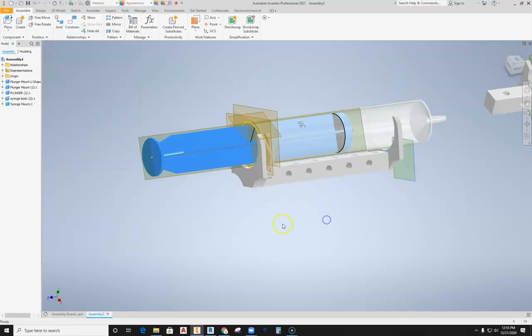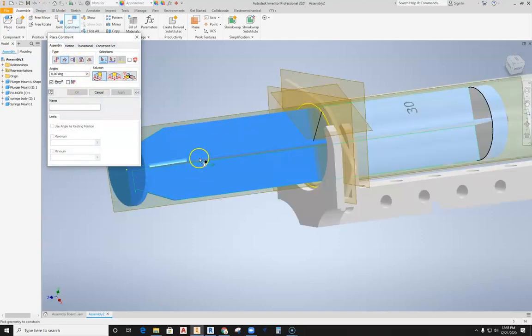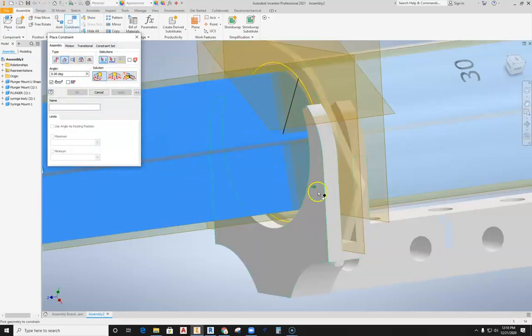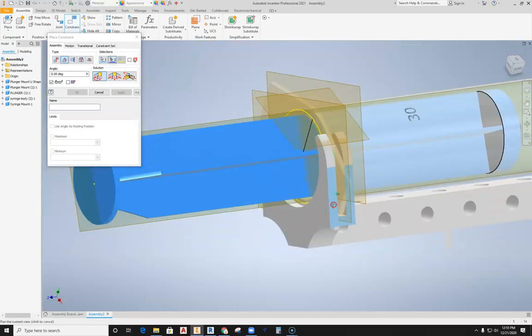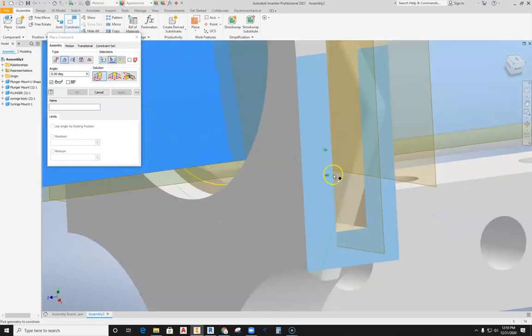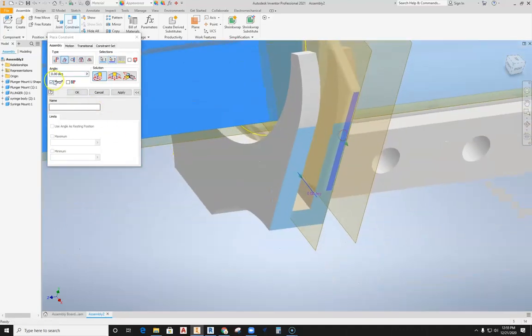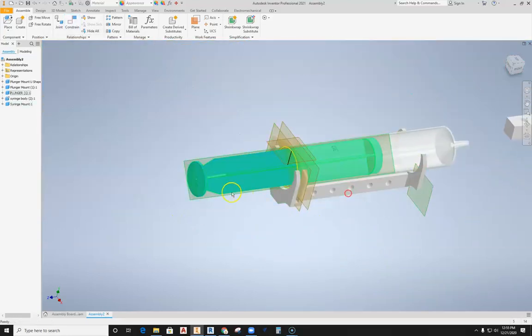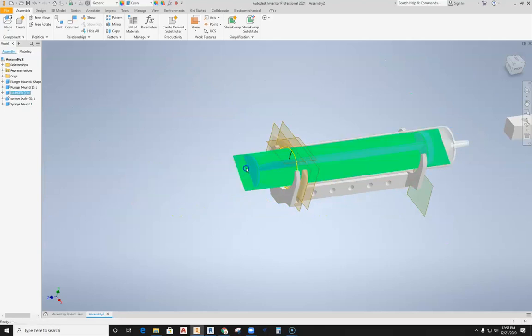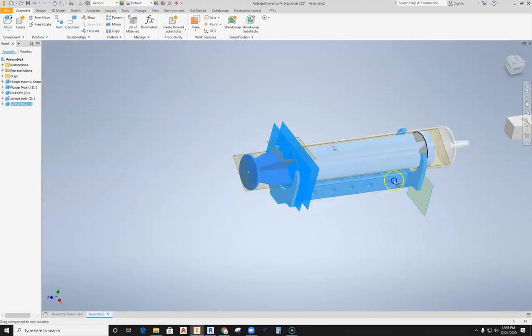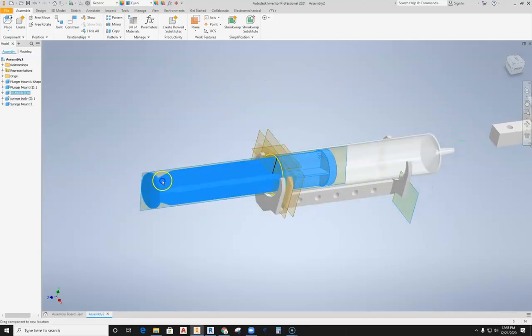So what we're going to do is I'm going to then constrain again. I'm going to grab angle this time, and this is a simple angle. I'm going to tell it this surface right here and this surface here—so that surface and the edge of the syringe there need to be set to a zero angle. I'm going to hit apply again and then cancel. Then what I should be able to do is move this back and forth and then this not move. So that's now fixed and that's in position. That's good.